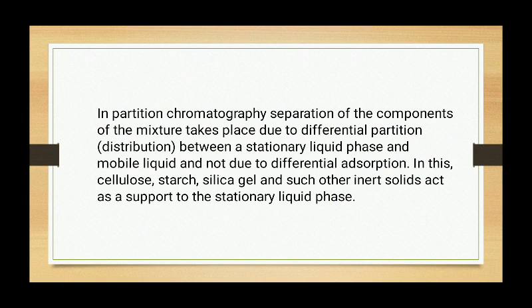In the previous presentation, we have seen the introduction of chromatography, types of chromatography, and also the principle of column chromatography. Today, we shall continue the principle of column chromatography.